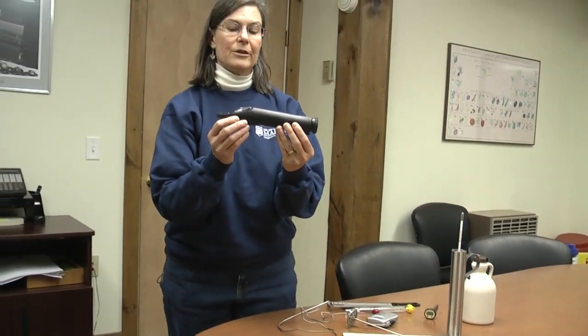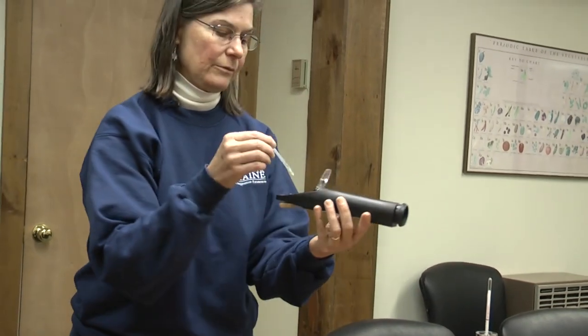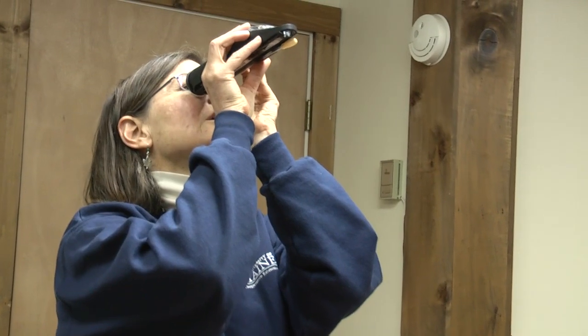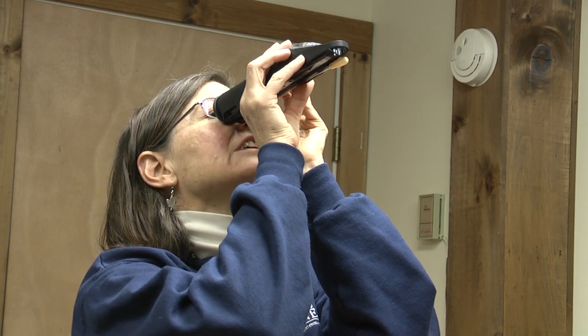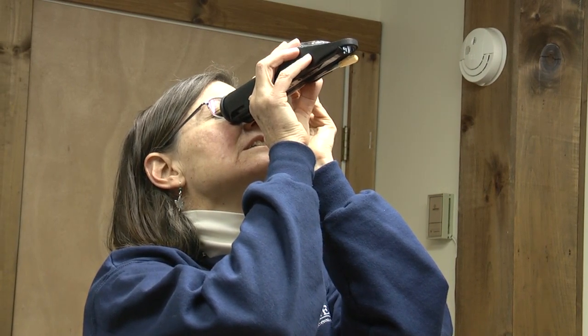Another instrument you can use is a handheld refractometer, and that works with the prism and the refraction of light. You have a prism on the front, and you'll take an eyedropper or a little stick and put a little bit of syrup on that prism and rub it around. Close the little door and you're going to look up and get a reading in the refractometer. There's a scale inside that you can see, and a shadow line will come across — we are at 66.9 on this measuring instrument as well.